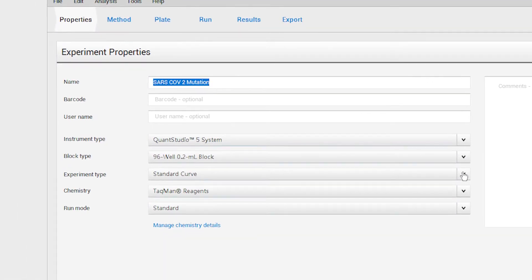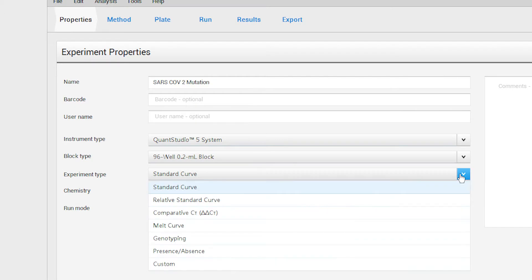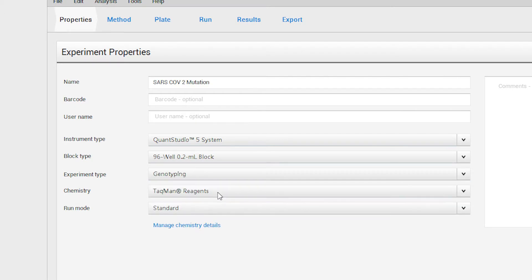Under Experiment Type, use the drop-down menu to change from Standard Curve to genotyping. Keep the chemistry at TaqMan Reagents and run Mode at Standard.